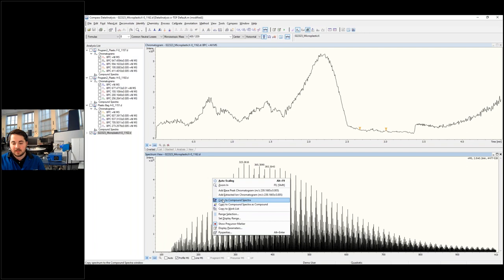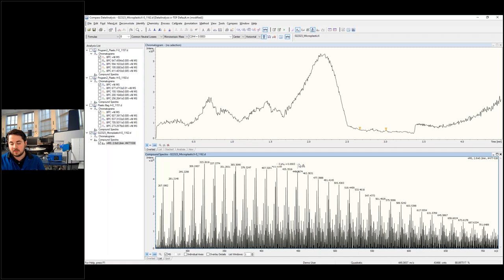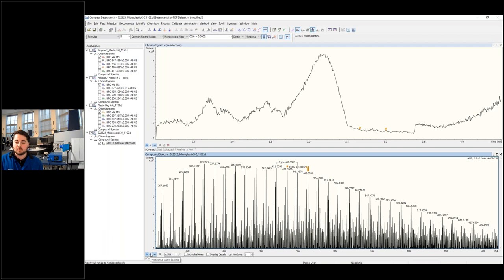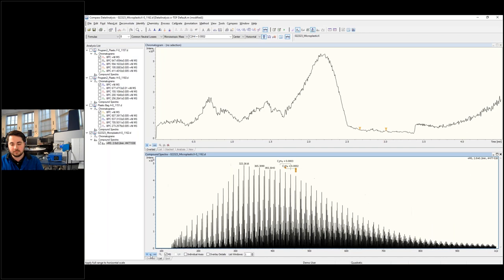So what we have here is your kind of standard chromatogram. Now, you can kind of think of this as your GC profile. So as time progresses, we're looking at not just a different time point, but a different temperature point. Now we can go back to that CSV file in the ion rocket control page and match up these time points with what temperature we were currently running at. So from here, we can kind of take a look at different temperature points at about a little over half a minute. We were looking at about 150 degrees, 200 degrees. So what we can see here are a couple of large ions that are kind of dominating the spectra right now, which is 391, 411, 149. This kind of gives us a look, again, at the polymer at this specific temperature region. But once we go up about another 150 degrees, we start to get a whole new look at this polymer. So again, now we're still seeing that 411, but now we're seeing 369, 256. But even more interesting, what we're now seeing is this polymeric distribution. So we're really starting to break down whatever that plastic was. Once we go just a little bit further, so now we're seeing a whole new set of potential additives. And once we look past that, so just go a little bit further, we're really starting to cook the polymer. We're breaking it down, and now what we're seeing is just the pure polymeric distribution of that sample.